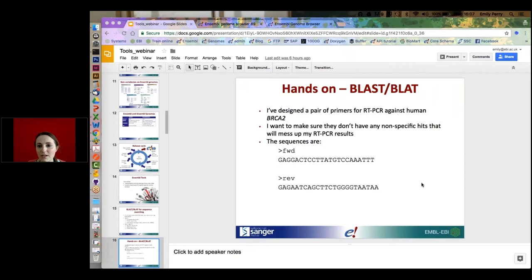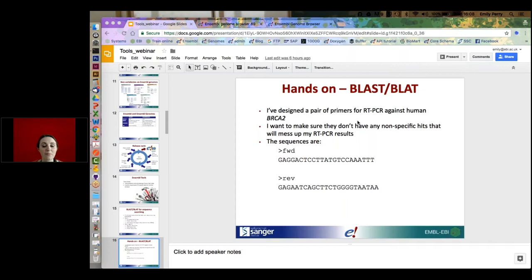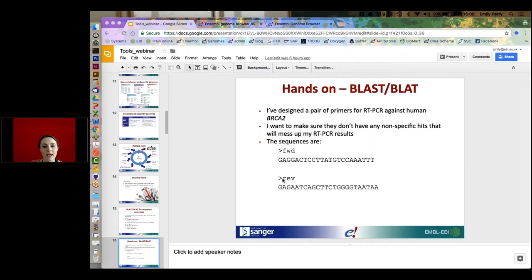I'm going to do a quick demo using BLAST. I've got a pair of primers for RT-PCR which go against human BRCA2. I want to make sure I don't have any non-specific hits that will mess up my PCR results. I can BLAST one sequence at a time, but I can also put in two sequences at once using FASTA format — a header line with an arrow, the sequence name, followed by the sequence, then a new line, and a second header for the reverse primer.